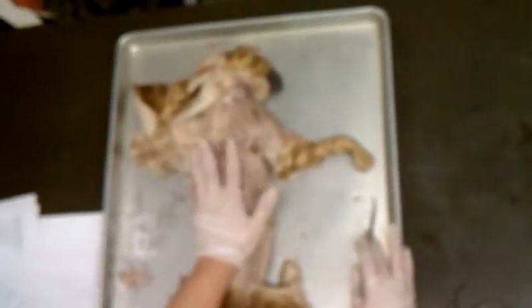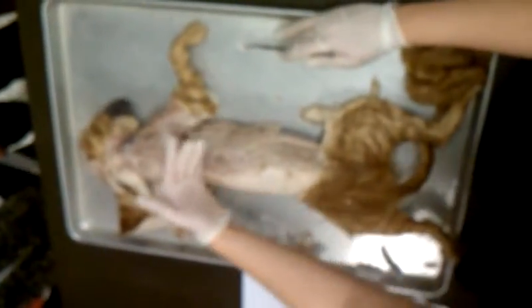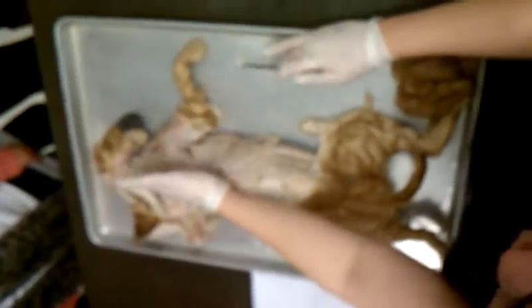Muscles, you have a nice kind of cool naming convention, okay? You have 6 muscles, and they have prefixes and suffixes, which is great. So the prefixes, you have 3 prefixes, and they are related to how high we're talking on the cat's back. The highest have the prefix clavo, like your clavicle, which is really high in your chest. The next set have the prefix acromio, like the acromion process on your shoulder blade. And then you have the spinos, which are near your spine. Those are the lowest. Then you have the suffixes, and they refer to if it's more medial or more lateral.